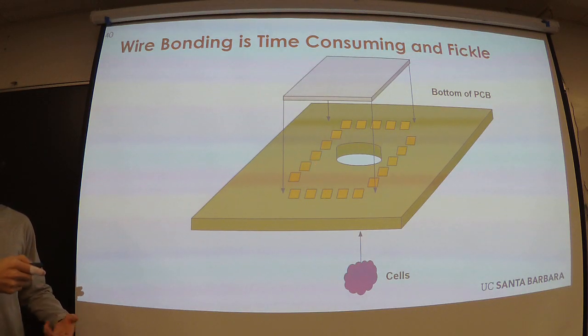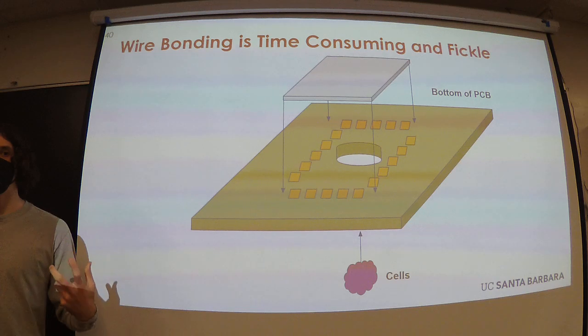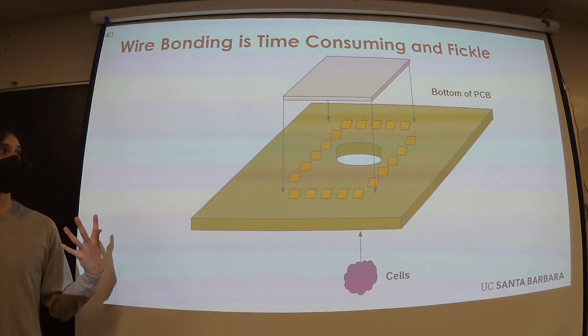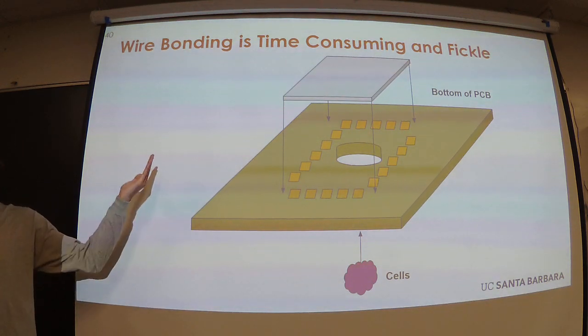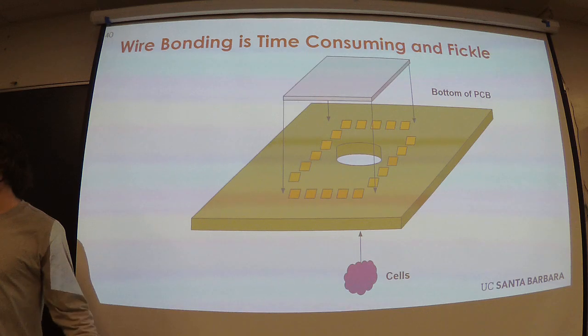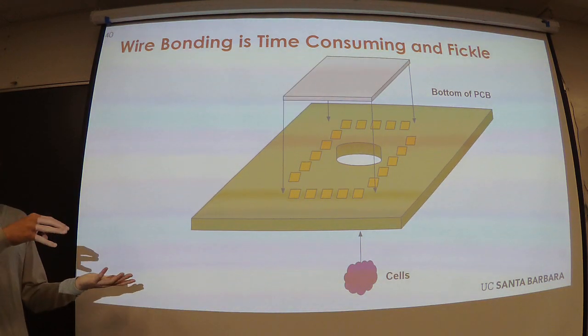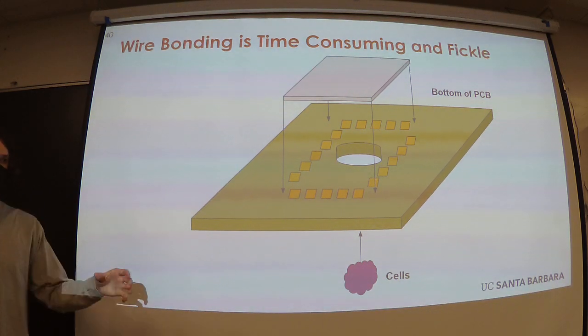I can put solder paste, which is basically a bunch of small metal spheres, on each of these pads, and then heat it up in a reflow oven, and this will make good electrical connection when it cools down. Then I can do all of the bond pads simultaneously, which means no more wire bonding, which I was very, very happy about. Once I'm done with that, I can flip it right side up, and I'll still be able to put cells on it.